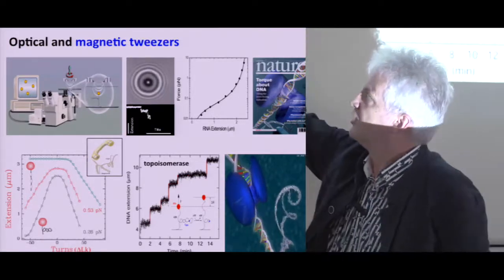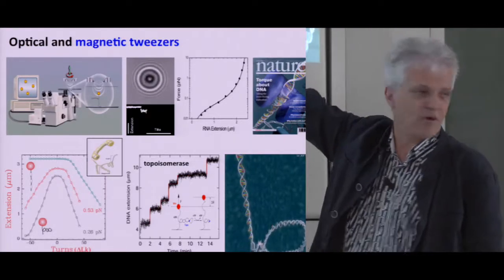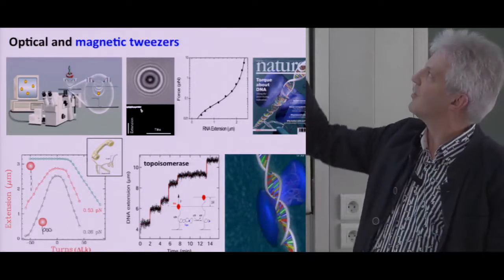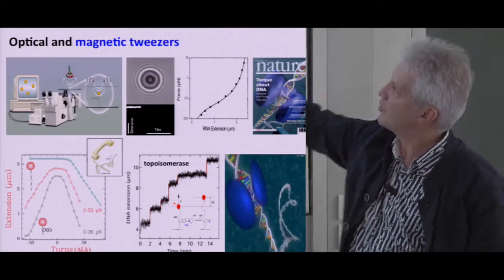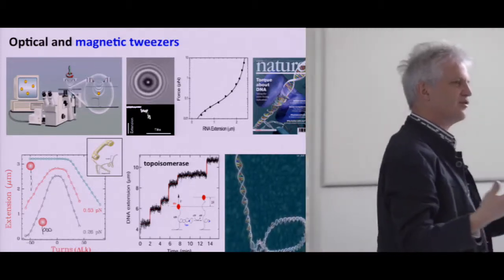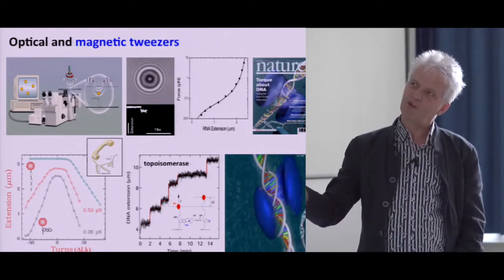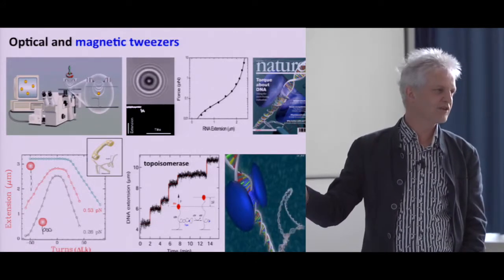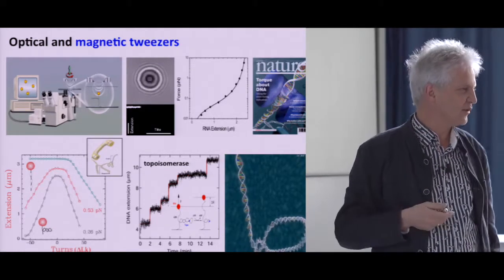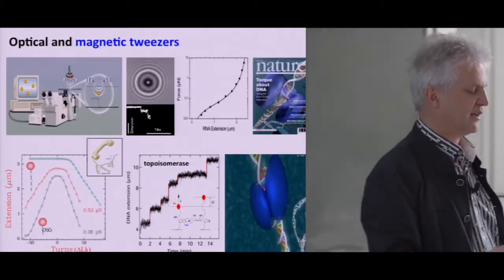And if we have such a lowered position, now we can flush in some proteins like a topoisomerase. These are proteins that grab onto the DNA, make a nick, and in doing so, for example, it can swivel around the other strand that is there, and then relax some of the supercoils, so you step up. So this is just an example of a measurement where nanotechnology addresses some of the nano world of biology. And I find it quite astonishing because it's a super simple setup where you have an optical microscope, you look at some images of some bead, and you measure the height from that. By this simple measurement, you address the action of a single protein on a single DNA molecule. So I think it's very powerful, this whole toolbox of nanotechnology to address phenomena at this very tiny scale.